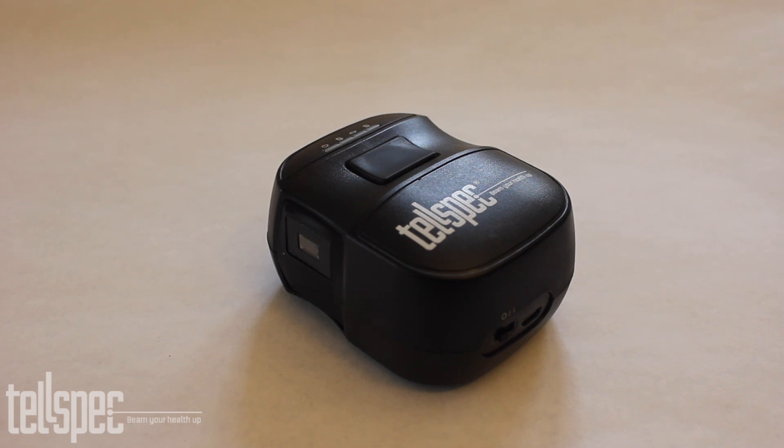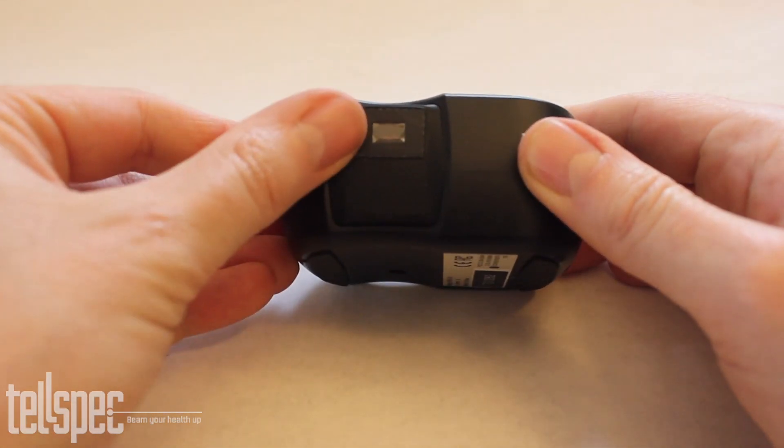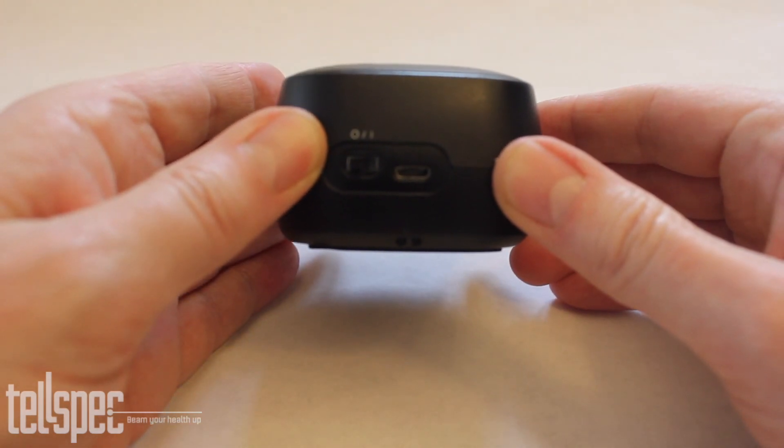This is the Telspec handheld spectrometer. The scanner itself is handheld and portable. It has a window at the front and a button on the top. There are ports and a power switch on the back.